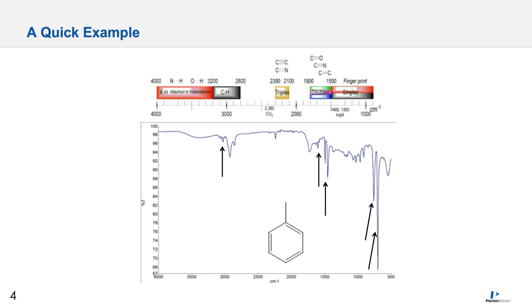We're seeing the carbon-hydrogen stretch of an unsaturated system. In this case, moving towards the right, we see several peaks which provide added insight into the nature of those unsaturated bonds. That this actually indicates that there is a monosubstituted aromatic ring present in the sample.